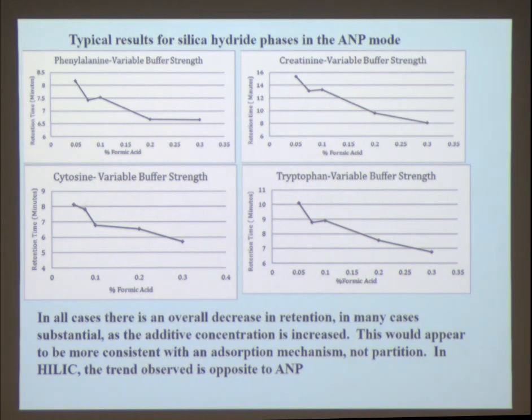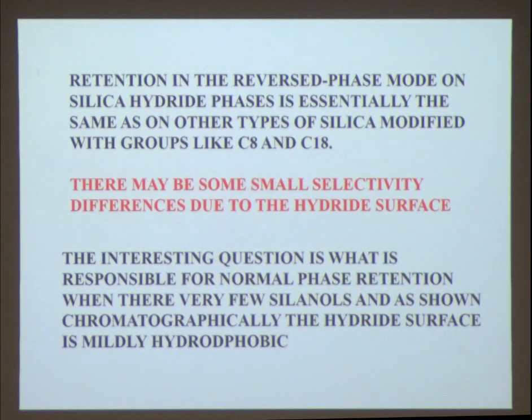But in the case of aqueous normal phase chromatography, we can use less salt and get more retention. So the mass spec source is clean for a much longer period of time and is much more reproducible. So it has a practical effect too.